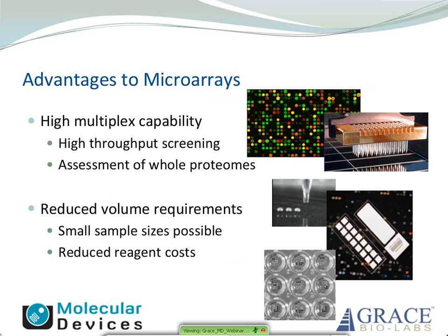But protein microarray technology is becoming more accessible, and researchers are beginning to benefit from the multiplex capabilities of this technology. With relatively few modifications to current ELISA and Western blot methods, it comes the ability to assess more than 1 or 2 proteins at a time, allowing for a whole or focused proteome analysis in single experiments. With this also comes the advantages of small sample requirements and reagent usage, which should translate to lower costs of your assays.